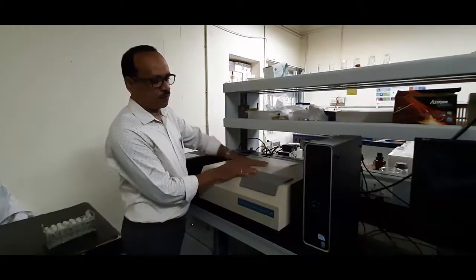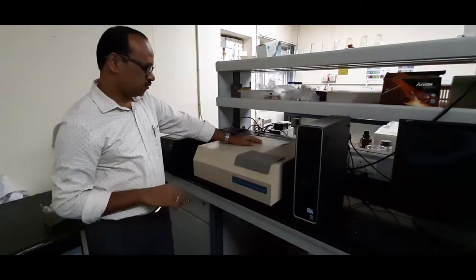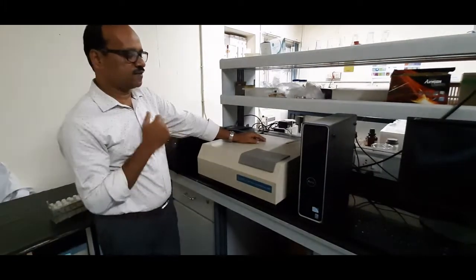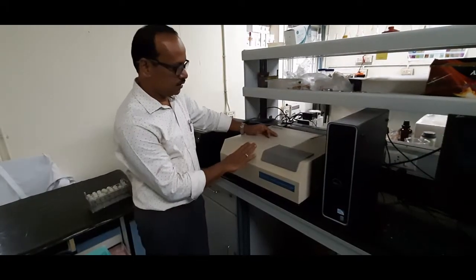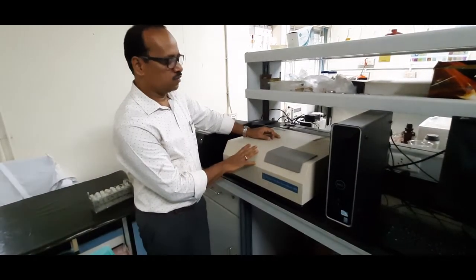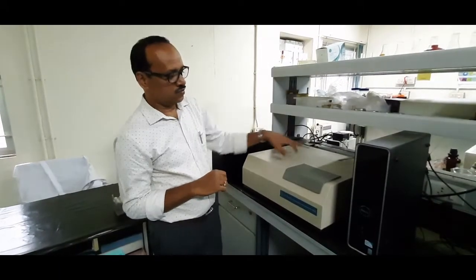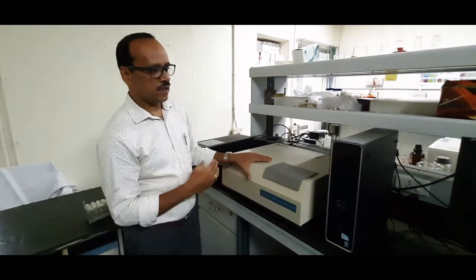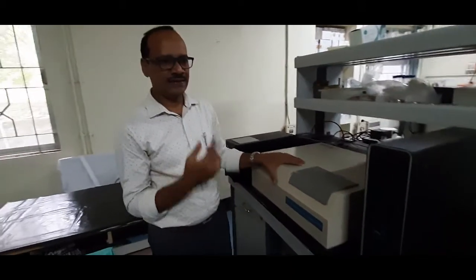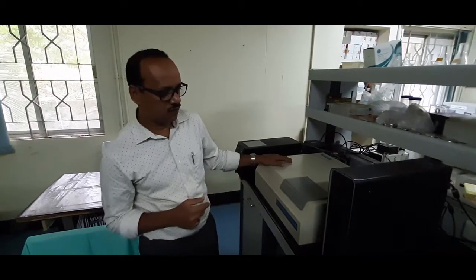This is a UV-visible spectrophotometer. In nucleic acid analysis, we need a quality check of the material extracted. We use the spectrophotometric method for nucleic acid analysis. Nucleic acids have maximum absorption at 260 nanometers under the UV range. This instrument is specially for measuring nucleic acids, with scanning at 260, 280, 300, and 320 nanometers, giving a good estimate of the amount, quantity, and quality of the nucleic acids extracted.